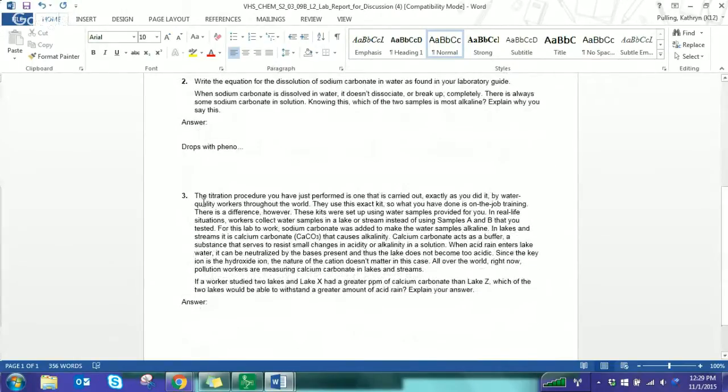Then the third question relates to real-world application, right? So these were prepared samples for you. If you were to work in a water treatment or water quality company, something like that, this is something you would do. And this is something people who have that job do all the time, all right? So the big thing down here is if a worker studied 2 lakes and Lake X had a greater ppm of calcium carbonate than Lake Z, which of the 2 lakes would be able to withstand a greater amount of acid rain, all right?